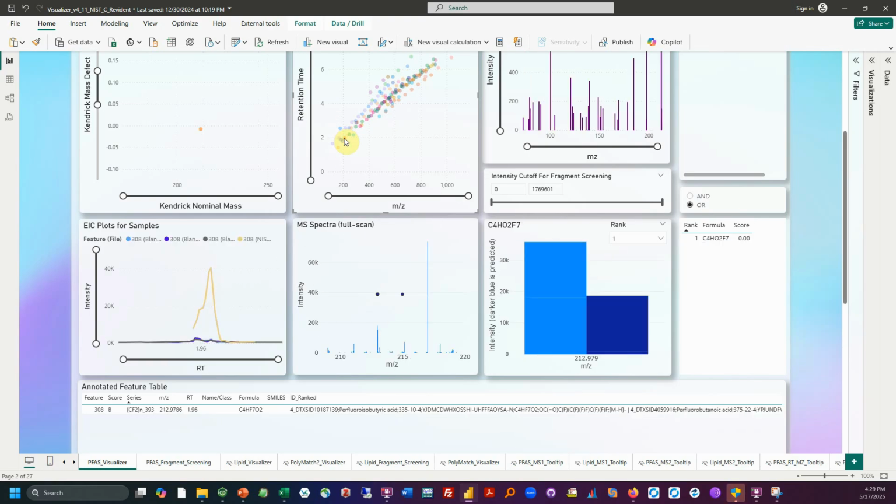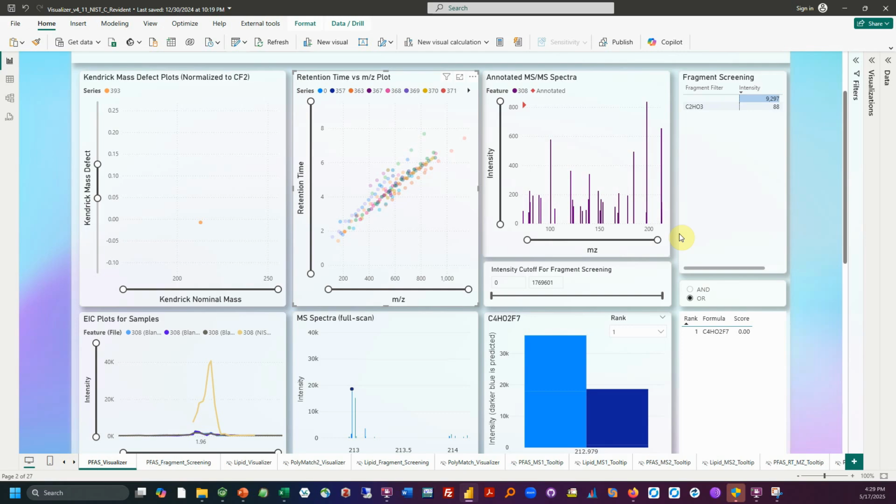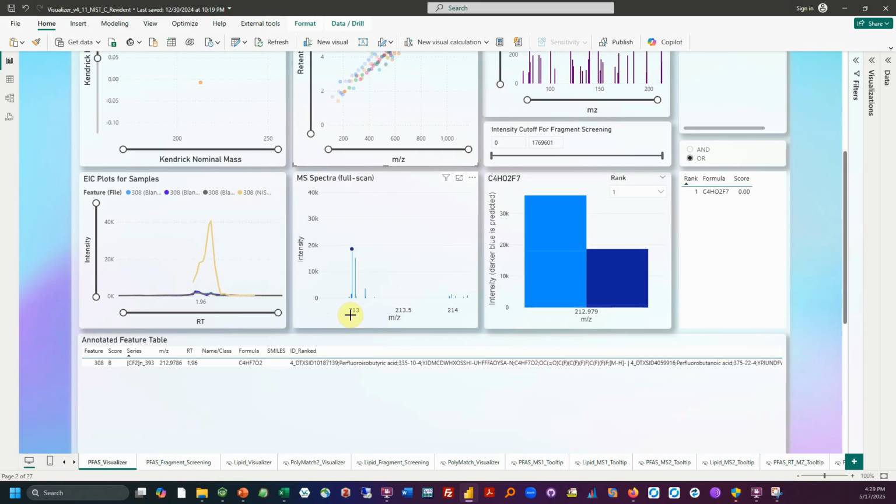But, for example, let's look at this example. Here you can see a number of peaks, 1, 2, a couple noisy ones over here that are within a very narrow window. They're very close to the molecule, so that means these were also fragmented, probably giving all of these noisy peaks, not just the molecule of interest.